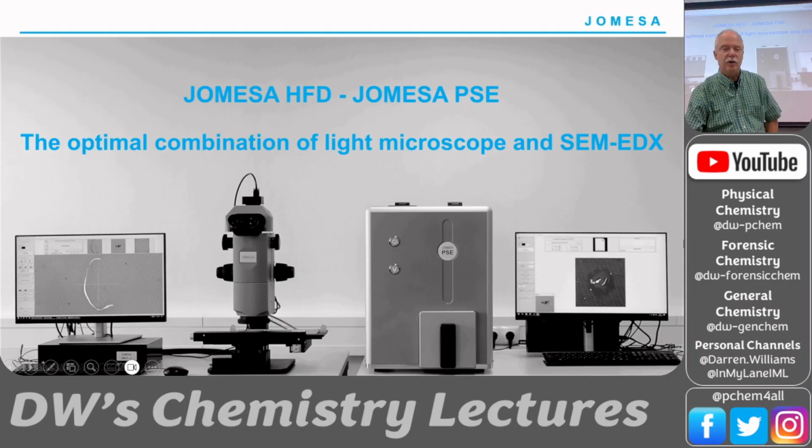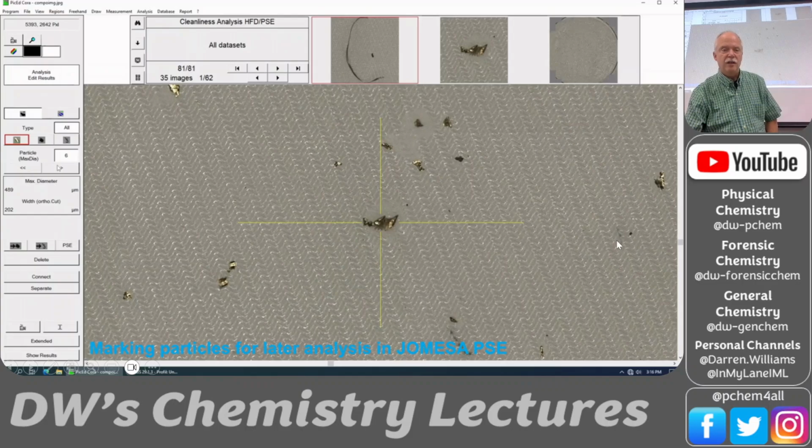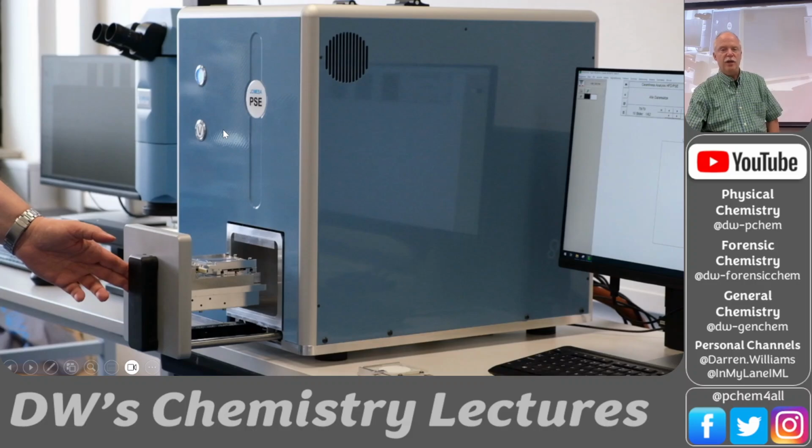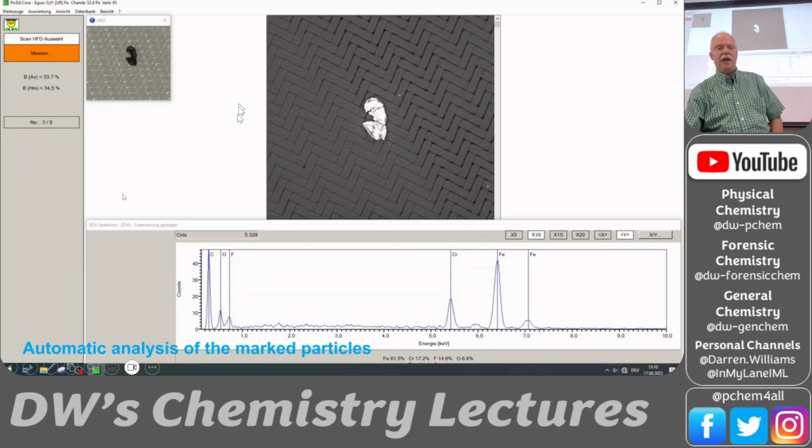So let me show you some of the particles that it found. Like in this case, it finds this particle. This is the optical image you can see up here. Here was a fiber. There's a particle. There's a bunch of different particles. It keeps track of every particle here. This is particle 81 out of 81 that it found on this disk. We put it in the SEM, and here's the optical image of the particle, and here's the scanning electron micrograph of the particle. But this is the beautiful thing right here.